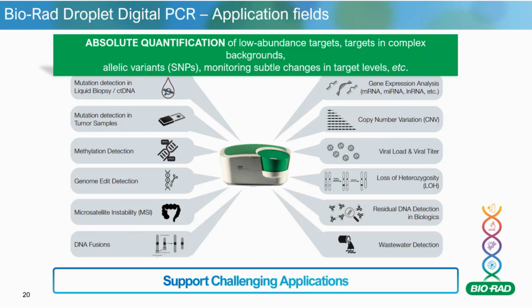So being able to monitor that in a much more quick and accurate method in real time almost, because what's happening to the patients is happening in their blood, instead of coming back every 2 or 3 or 4 months to monitor, means much better detection. And with ddPCR, this is only possible because of that high level of sensitivity, that limit of detection being much higher.